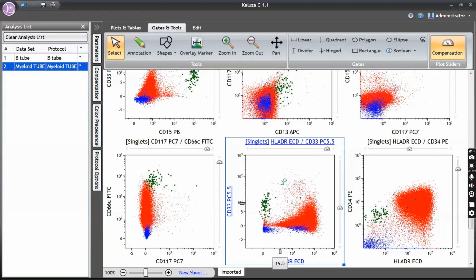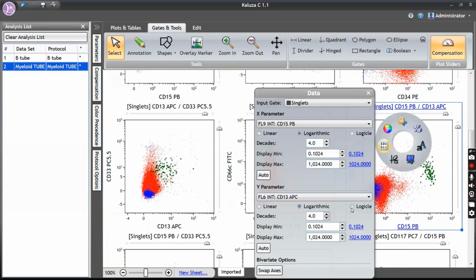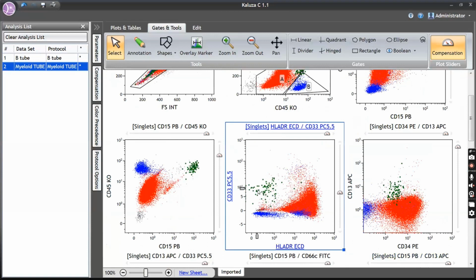B lymphocyte, monocyte. Perfect, super. B lymphocytes and monocytes will be a positive internal control for HLA-DR. So you find the HLA-DR normal B cells are here. The normal B cells are here. And this is the neutrophil population, which is a negative control for HLA-DR. Even T lymphocytes can be positive only when they get activated. So I would draw the quadrant somewhere here.